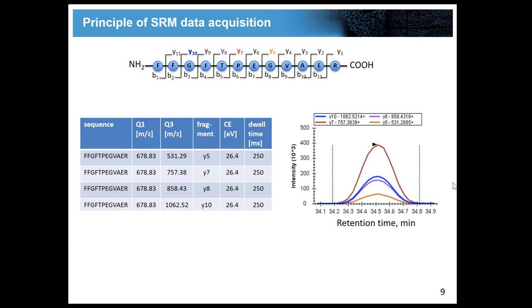But actually, this figure that you see here is not really the raw data. This is already a figure that is processed by the analysis software, which extrapolated these peak shapes. The data that the instrument really measured were just distinct intensity values, right? This is what we just saw in the slides before. And then the software just comes and extrapolates a smooth line over all these intensity values. But with this knowledge about the peak extrapolation, I think it becomes very clear that the time difference between 2 of these neighboring intensity data points is very important.